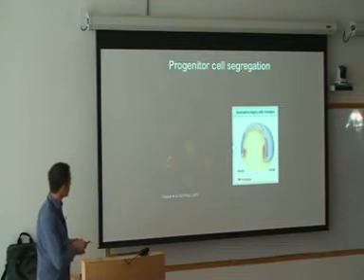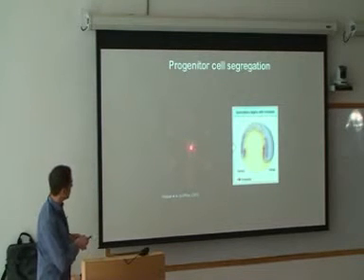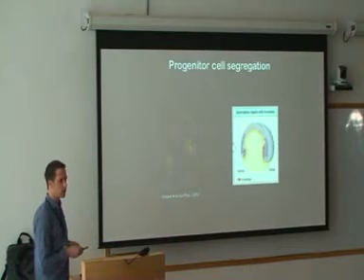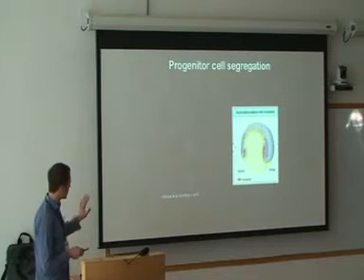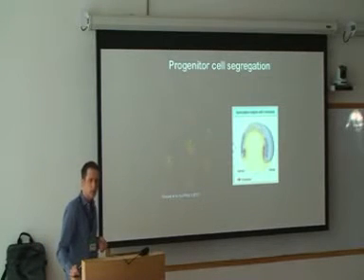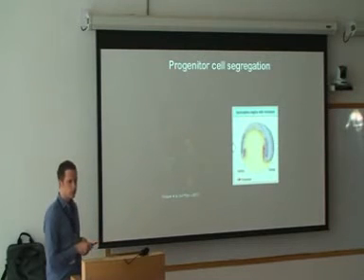You're putting them in. Red is ectoderm, green is mesendoderm. I hope you can see that actually. The red cells are forming homotypic clusters, which are surrounded by homotypic clusters of mesendoderm cells. There's a very, very clear segregation of these progenitor cells, and ectoderm end up in the middle, surrounded by mesendoderm. So we can actually use these culture assays now to understand how these cells are segregating, how they are sorting, to eventually understand how that process works in the embryo.